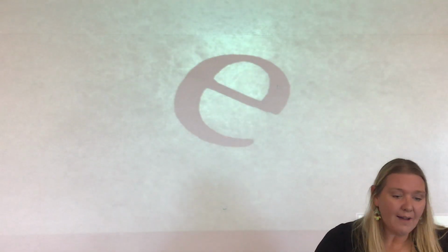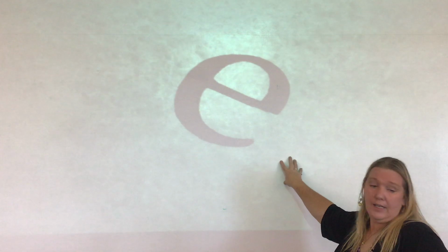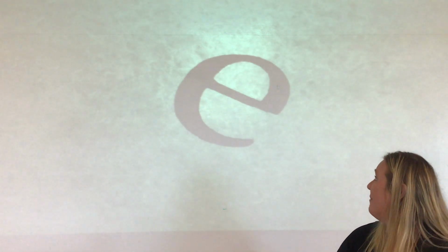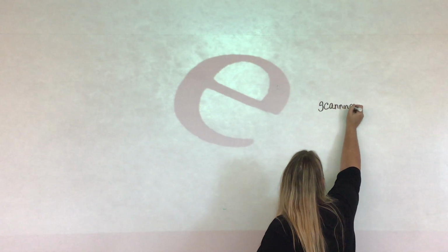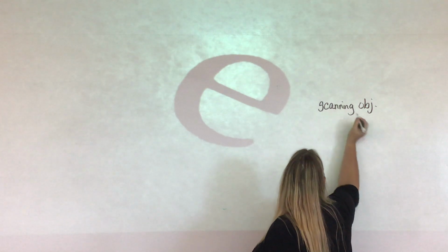Okay, so I have a slide of the letter E already on here for us to look at. This is the scanning objective. I'm going to write in black because the green probably is not going to show up on here. This is the scanning objective. I'm just going to abbreviate that.